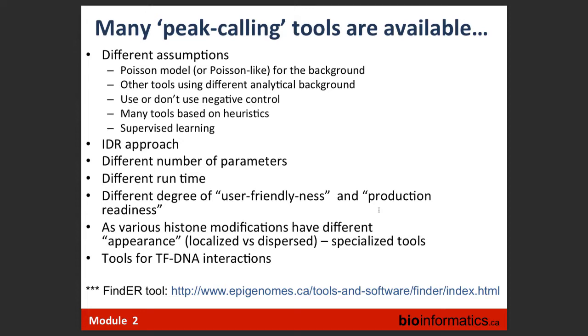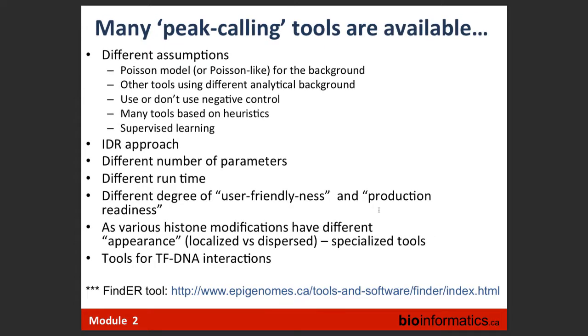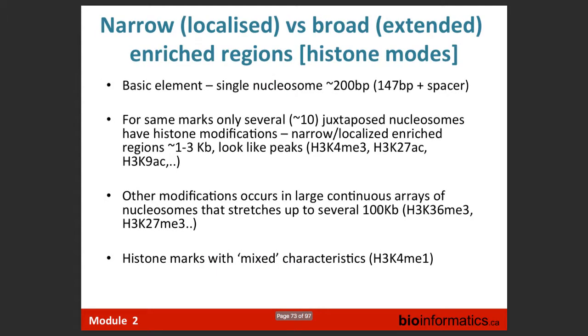So there is one tool which is the winner of this game at the moment, which is MACS. I will be talking about this tool later. And the people at the table here, all of us are involved in ChIP-seq tool development, so we'll mention this as well. So maybe a few words about peak calling, unless you want to interrupt me with some questions at the moment.